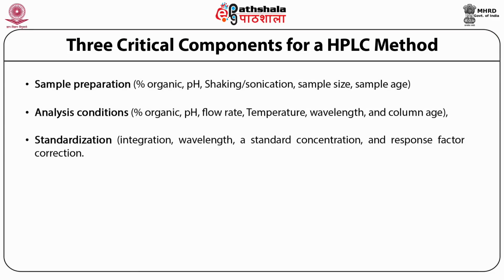Critical components for an HPLC method. The preliminary method development stage involves the investigation of all the components to be used in the entire process. This gives the analyst a chance of critical evaluation of each component and optimization of the final method. As time is a crucial factor, the time percentage spent on each stage is noted so as to enable the analyst to spend sufficient time for each stage.